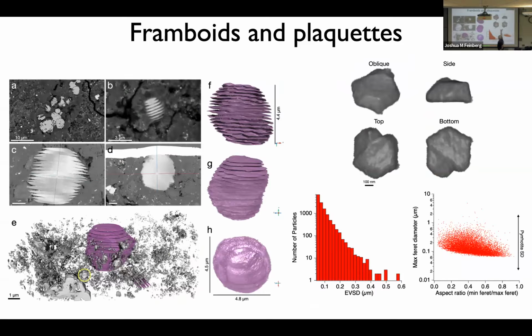It's this perfect hexagonal morphology. So you can show from the morphology that it's probably pyrrhotite. You can get a complete breakdown of the size and shape distribution of those pyrrhotites. And this is the single domain size range for pyrrhotite. So your matrix is filled with beautiful, highly spaced, non-interacting single domain pyrrhotite.